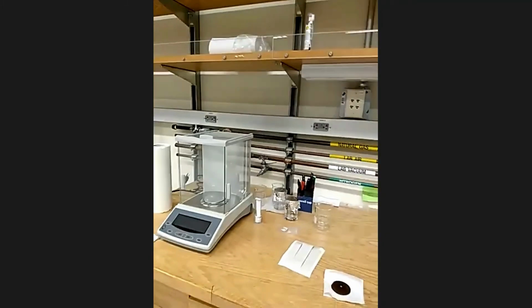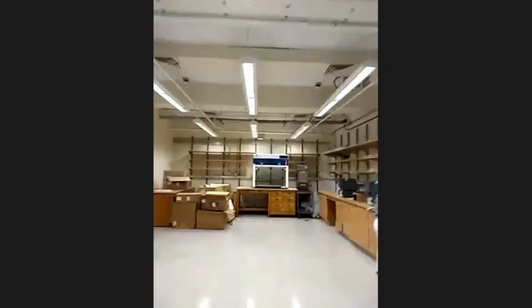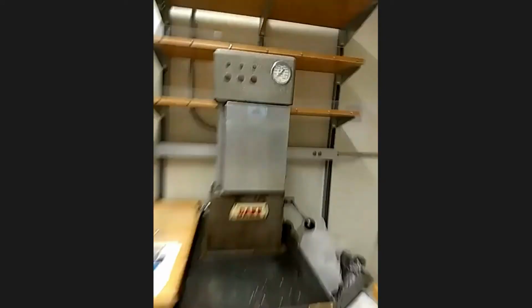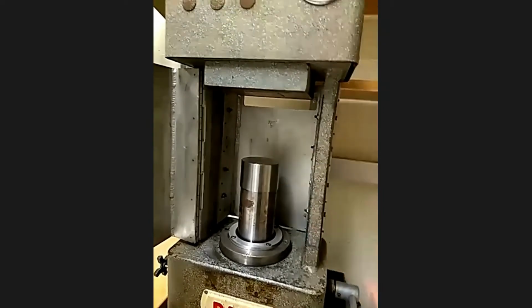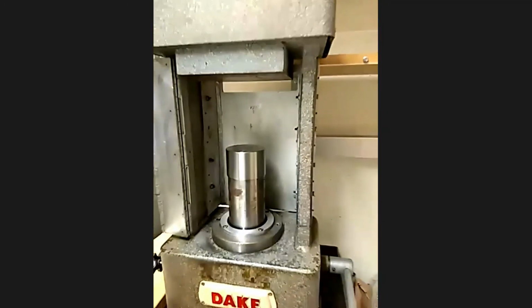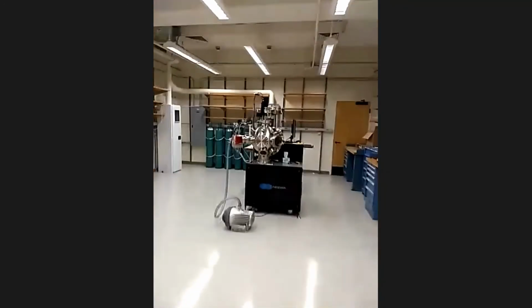By the way, we create the powders. After we create the powders, we mix them well, and we create a pellet with the hydraulic press, which is way over there. At the end of that, we have this hydraulic press, which is this guy. Inside that, we place the powder inside a puck, and just use this handle to crank up the pressure. Once the pressure is high, it creates a pellet. And then we take that pellet, as Dong said, inside this PLD machine, which is right over here.